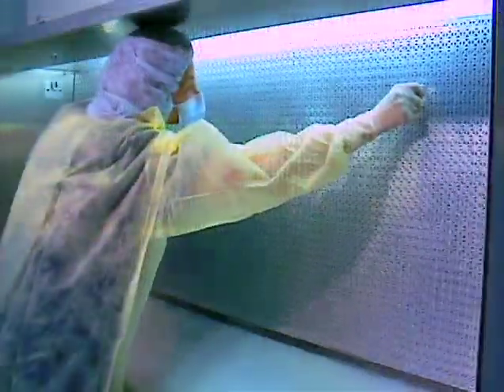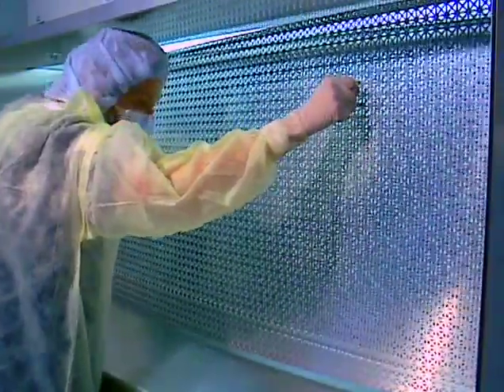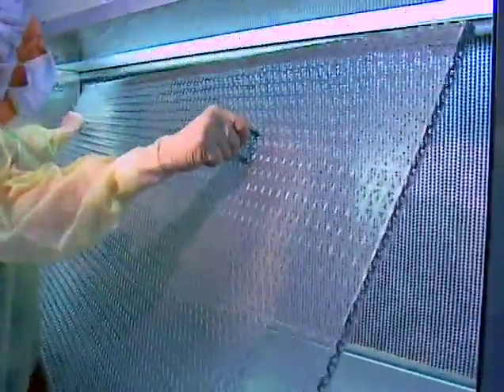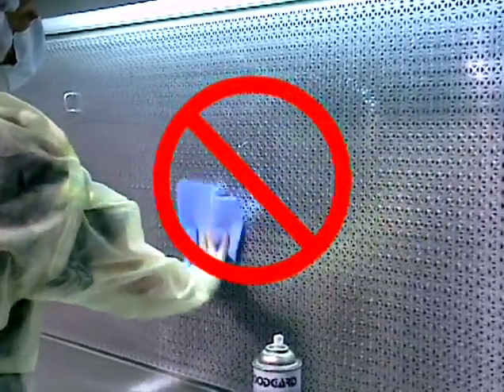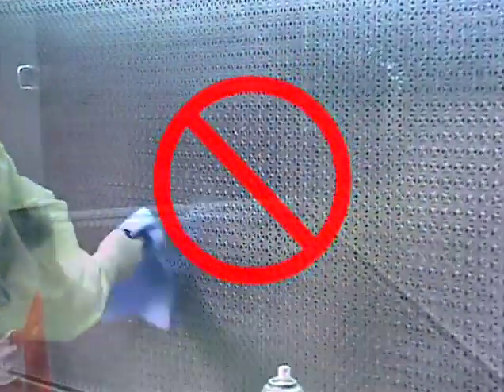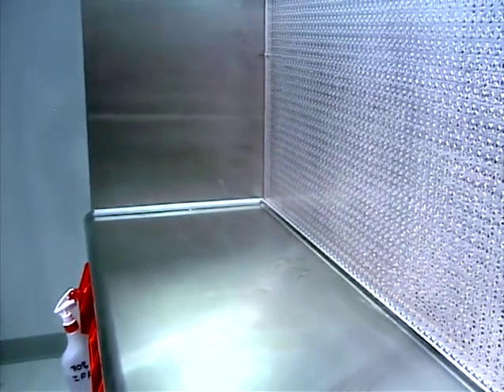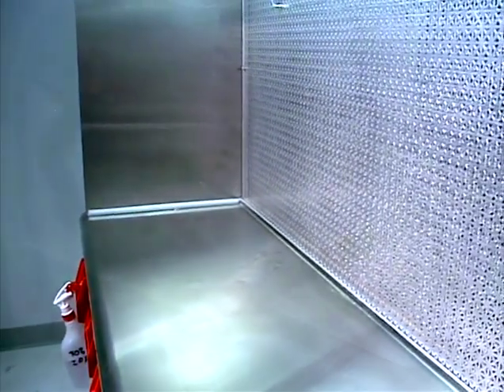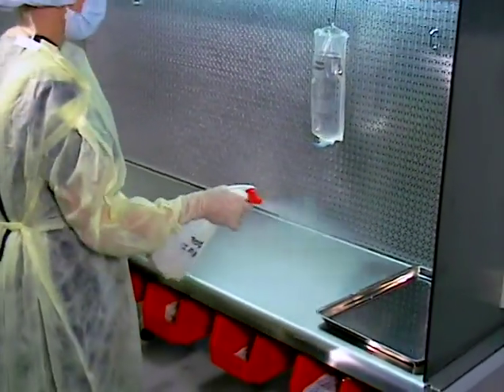If the LFCB is a modern design with an easily removed screen, it may be removed, cleaned, and carefully replaced. Do not attempt to routinely clean screens which are not designed to be easily removed, or damage to the HEPA filter is likely to occur. If proper manipulative technique is employed, the protective screen should not require frequent cleaning. Following cleaning, 70% alcohol should be applied and allowed to dry completely without wiping.